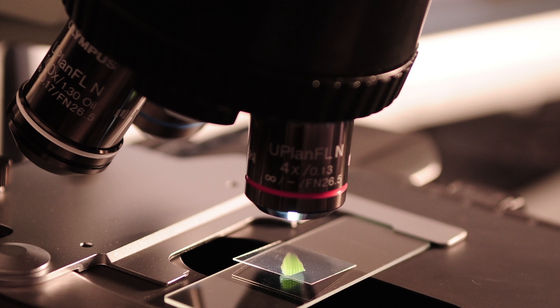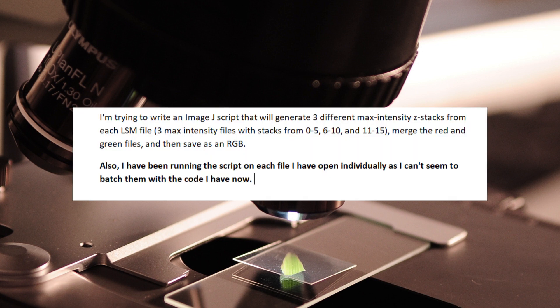Our problem is this: we want to write an ImageJ script that will generate three different max intensity z-stacks from each LSM file. Then we want to merge the red and green files and save the whole thing as an RGB. We also want to batch the whole thing so we can run the same analysis multiple times on different files.